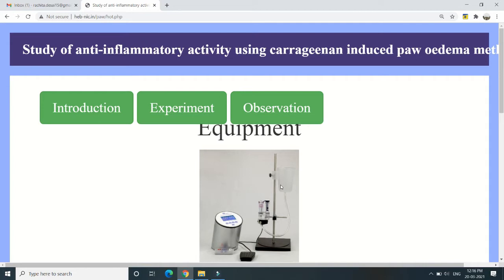The organ tube assembly is available here with a marking indicating how far to fill the saline solution. There is a reservoir where we fill the saline solution, visible at the top right corner of the equipment. Tubing connects to the organ tube where the fluid is collected. The red marking is for uniform filling of the saline solution — we fill up to this marking each time.